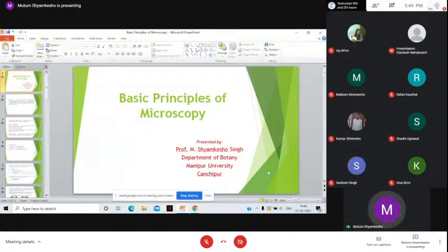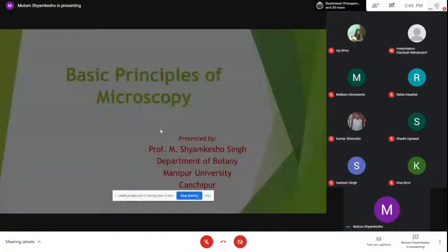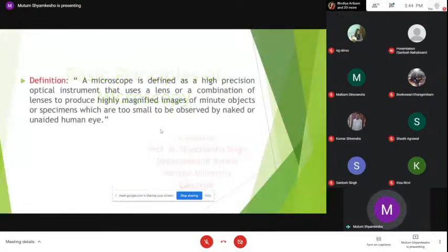The topic, as I have already told you, is the basic principles of microscopy. First of all, I am giving the simple definition of a microscope.